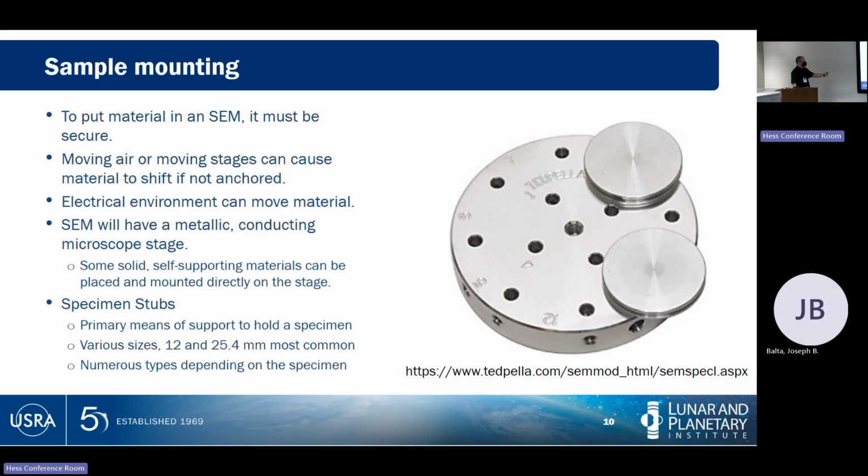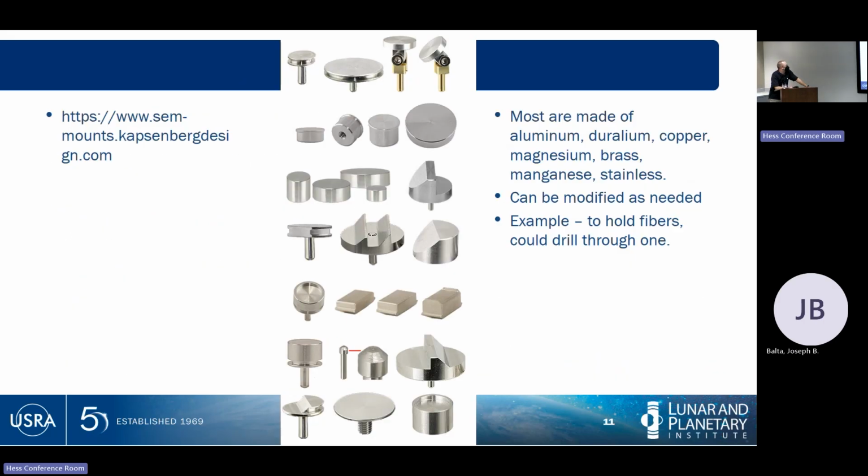There are various sizes. The most common, I think, is easily the 12 millimeter ones. And you'll see a bunch of these down the hall too. They have standard backs, so they will fit into holes that are available. I think manufacturers have all just kind of figured out that, yeah, let's just make these all the same size. That this is much easier if every manufacturer does the same thing with the size here. Because the thing you might actually want to customize could be the sample holder.